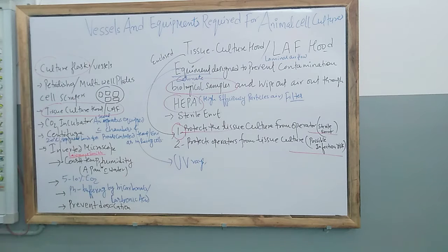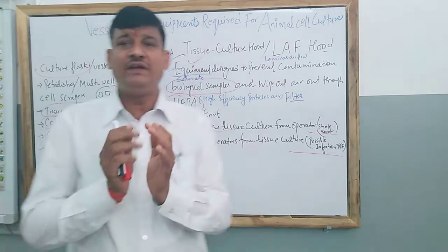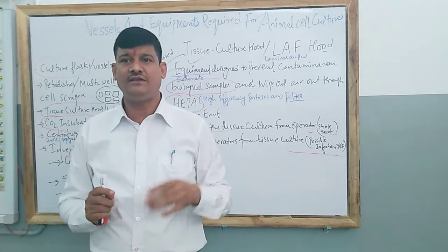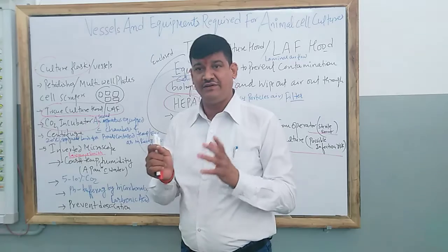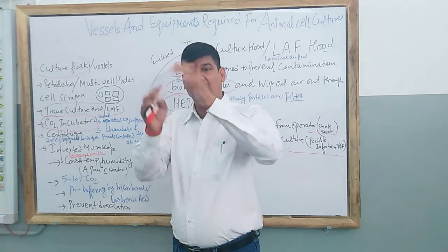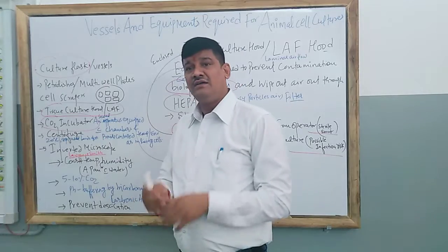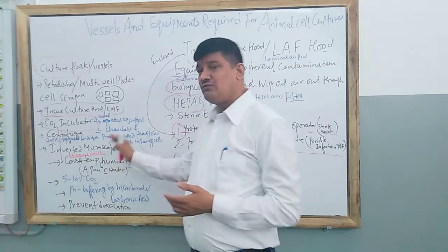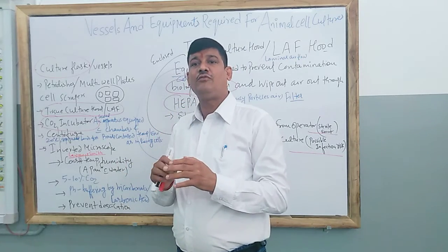Now the second one is the CO2 incubator. What is the meaning of incubator? There is a CO2 incubator in the bio lab, also in the biotechnology lab. So an incubator is an apparatus, a sealed enclosed apparatus, where we keep the biological samples or the tissues so that a constant environmental medium remains for a prolonged time period.